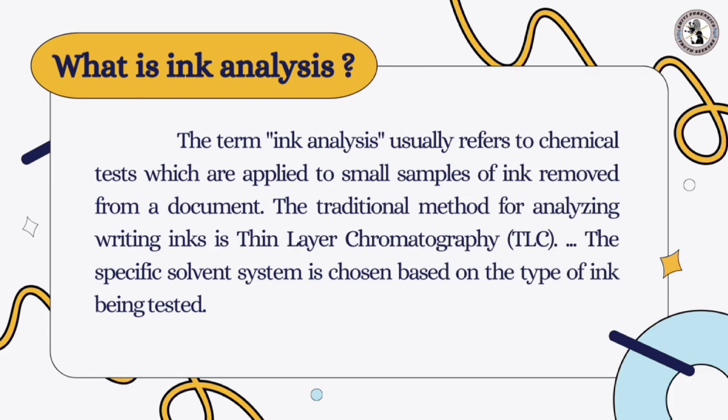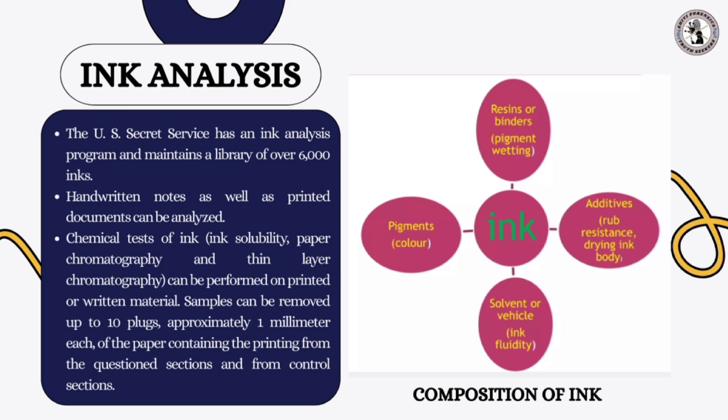So, the term ink analysis usually refers to chemical tests which are applied to small samples of ink removed from a document. Basically, the traditional method which is used is TLC, thin layer chromatography. Ink analysis was basically invented by the US Secret Service, which introduced the ink analysis program and maintains a library of over 6,000 inks.